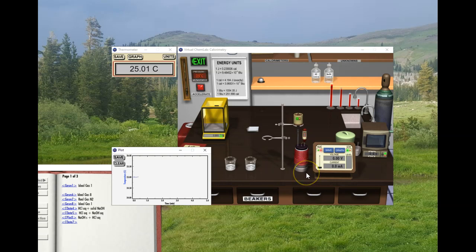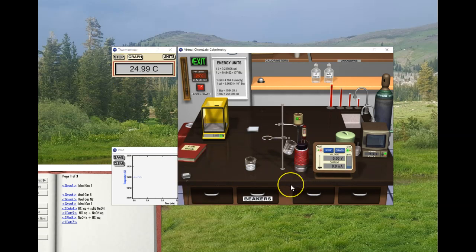The calorimeter is ready to roll, and we're going to hit save so we'll get our data. We're going to put in the first one, and we're going to make sure that it stays at the baseline temperature, which is 25. Then we're going to add the second, and now we're going to see the chemical reaction going on. And that neutralization reaction has an energy associated with it. And so all chemical reactions have some kind of energy associated with them. So we're seeing this exothermic as well.